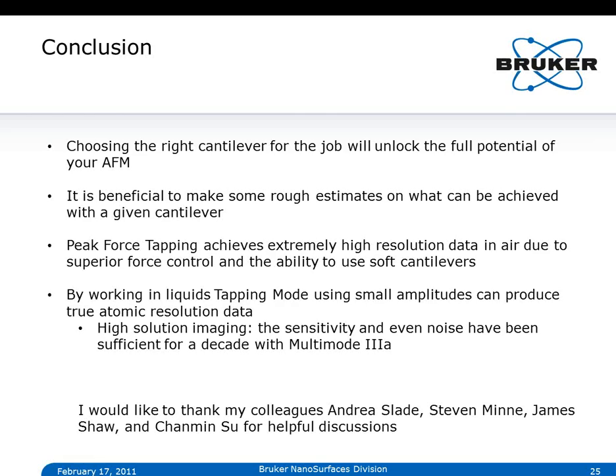And if you use a very stiff cantilever in that case, of course you get a beautiful looking force curve, but that cantilever simply will not deflect at the small forces that are required to do these measurements. Hence, you want to use a very soft cantilever.